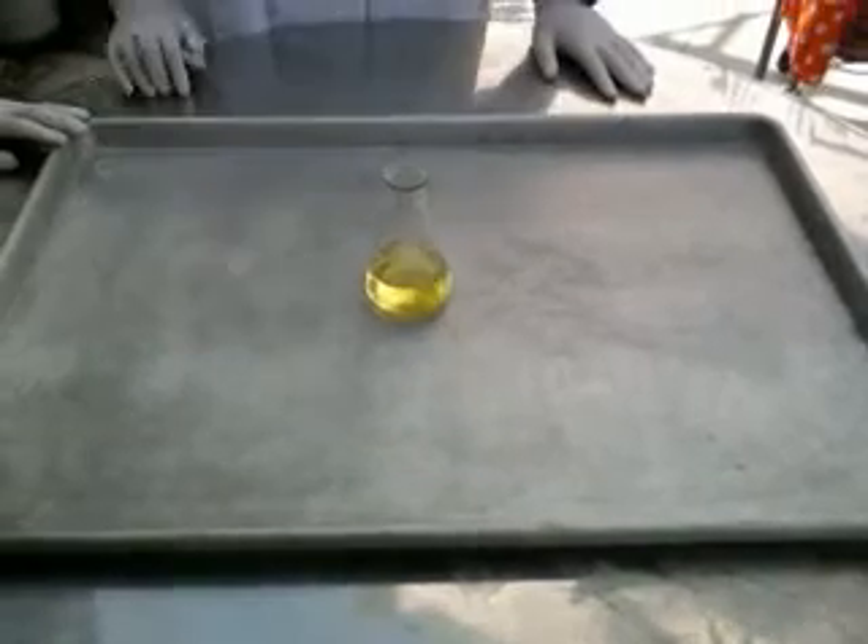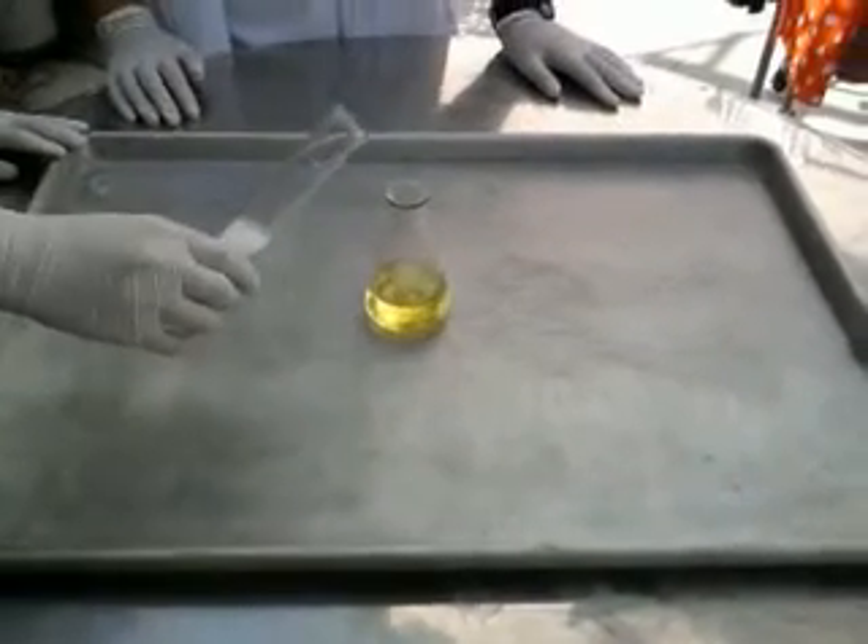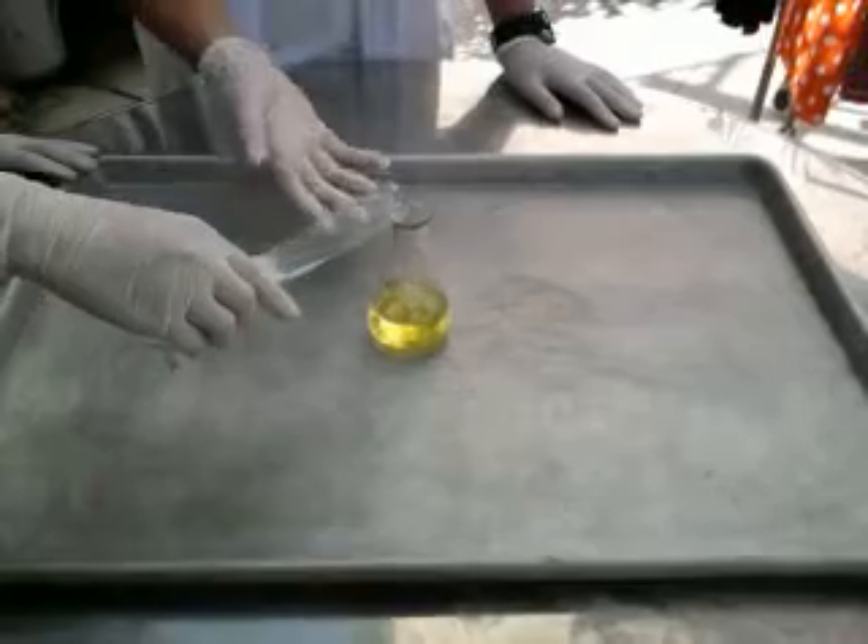So now we will start the experiment. First, you pour the hydrogen peroxide into the detergent.